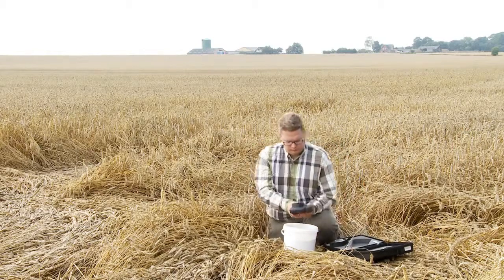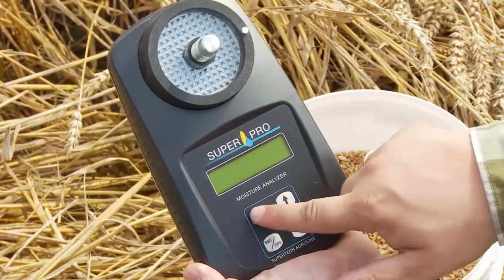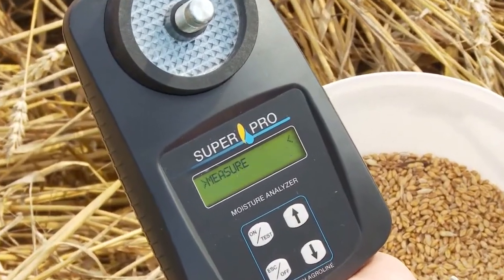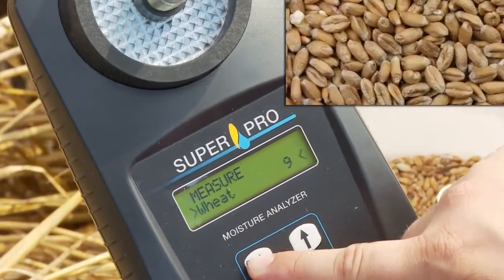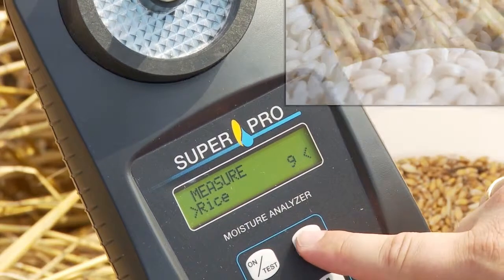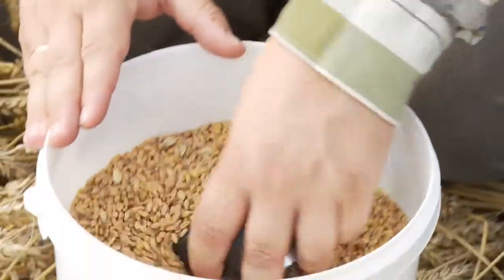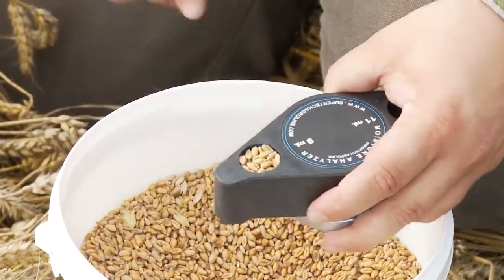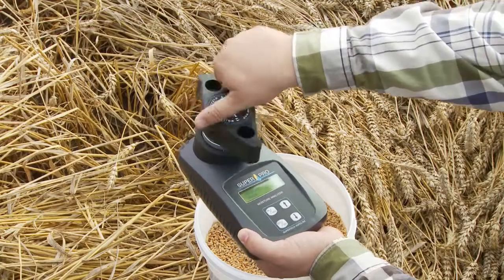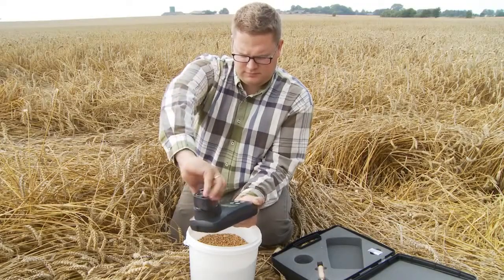SuperPro Moisture Analyzer is easy to operate. First you switch the SuperPro on. Then you choose the right crop using the arrow keys. SuperPro has up to 20 crops pre-programmed, depending on the crops grown in your area. The built-in measuring cup in the grinder handle makes it quick and easy to measure out the volume for testing. Pour the sample into the grinder, turn the handle to grind and compress the crop sample.